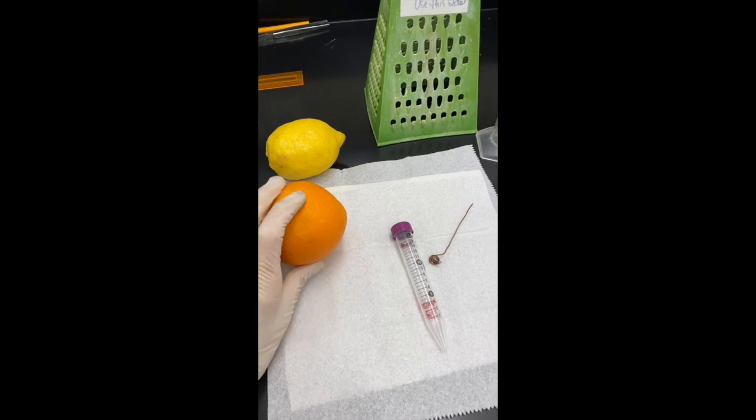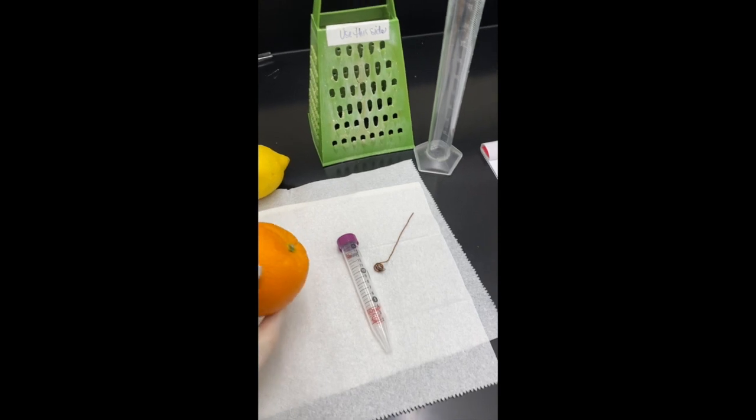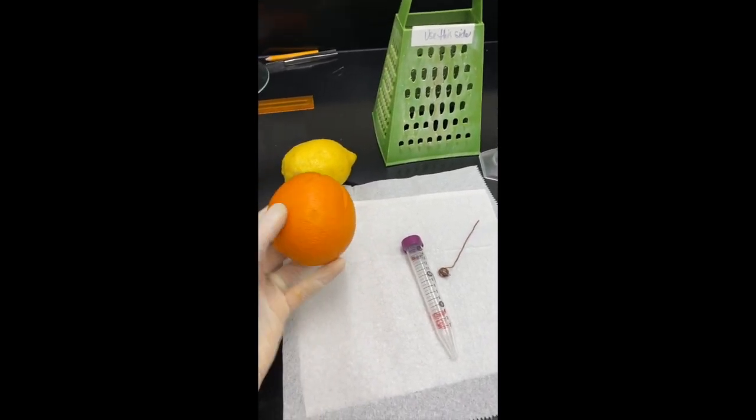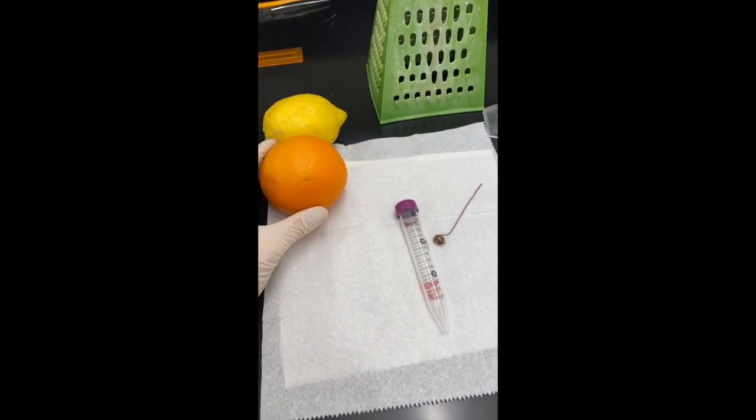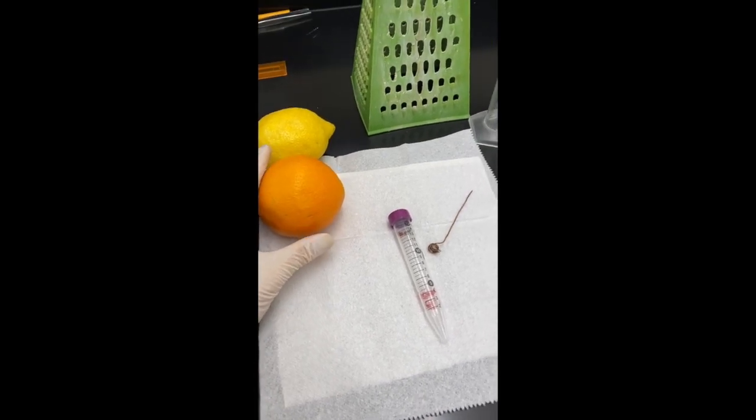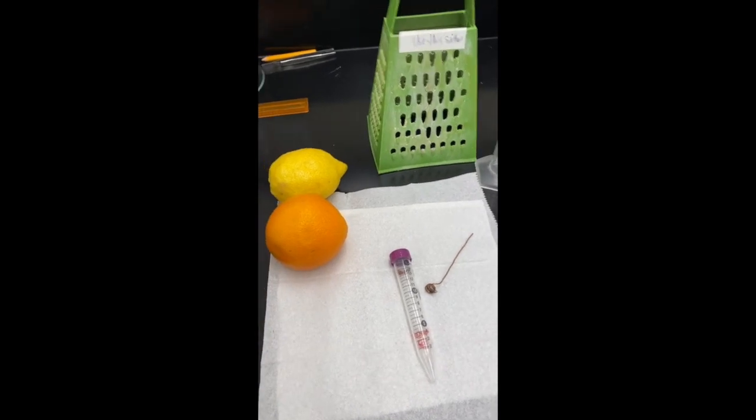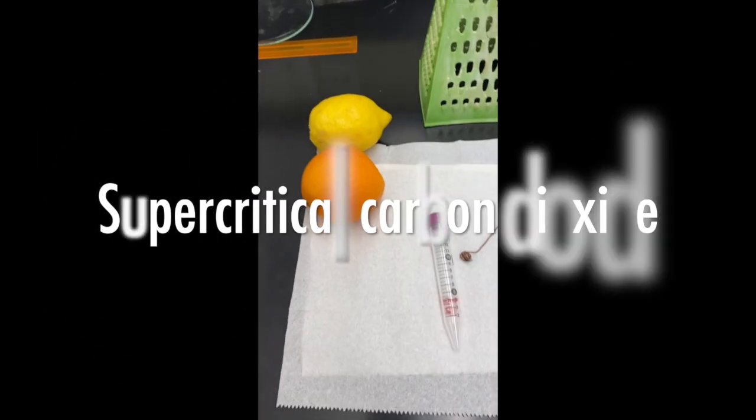Typically to do extractions we have our solid, which is going to be from the orange rind, and you can use a liquid, any kind of solvent really. But to do a green extraction we're going to use a greener solvent. In this case we're going to use supercritical CO2 or supercritical carbon dioxide.